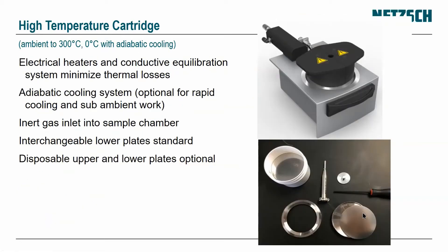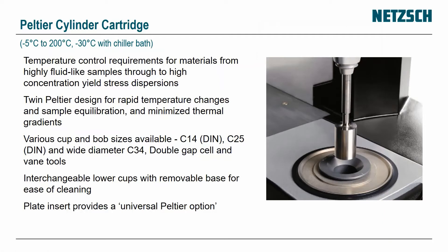We have a high temperature cartridge which is useful for polymer melts or curing samples, with disposable plates available. It can heat and cool with forced gas cooling, and the temperature goes up to 350 degrees C. Lastly, the Peltier cylinder controller goes from minus 5 to 200 degrees C, or minus 30 with a chiller bath, with very fast temperature control using twin Peltiers to accommodate all cup and bobs.